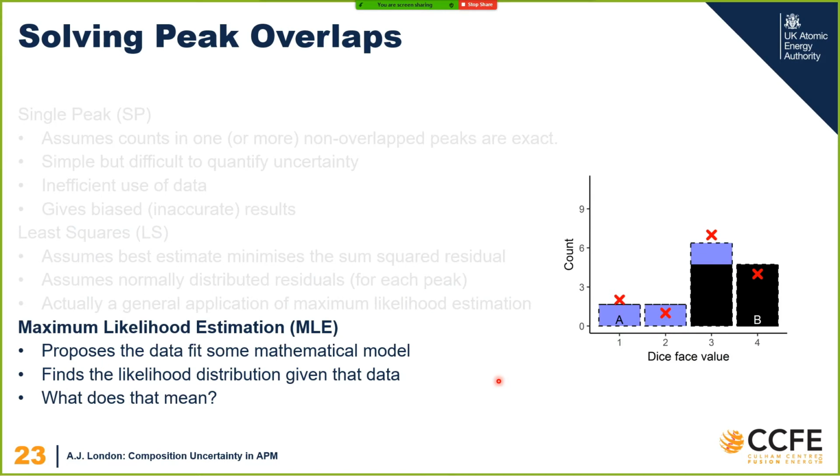And there's another option called maximum likelihood. The fit is actually different. If I just show you here, it doesn't make much difference. But this is using a more complicated mathematical model to fit the most likely result. You don't really need to know exactly what that means. I'm happy for you to take away that it's better and it just means magic.